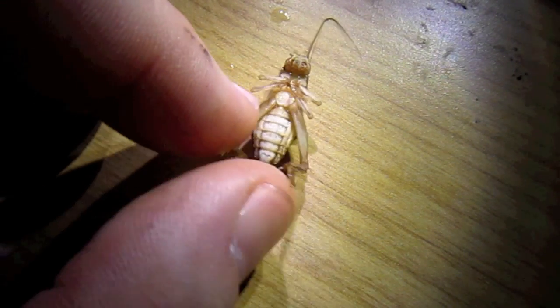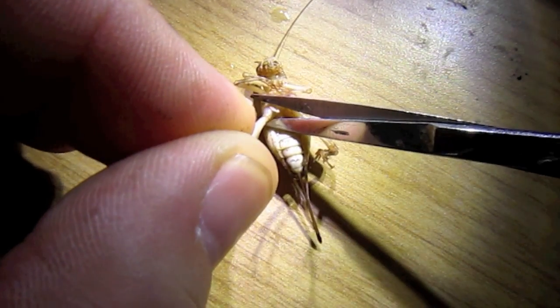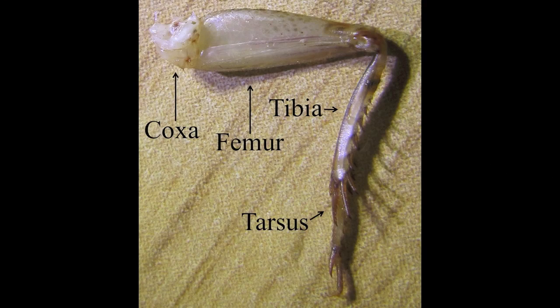The key thing here is to cut the leg such that there's a little bit of the coxa attached to the end of the leg you cut. Now notice we have the coxa, the femur, the tibia, and the tarsus. You should familiarize yourself with the anatomy.